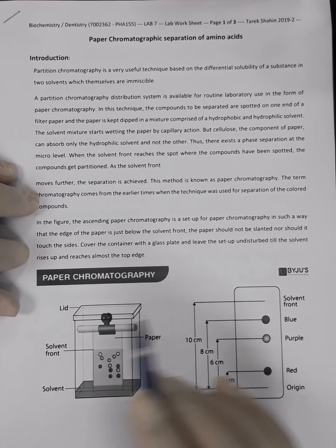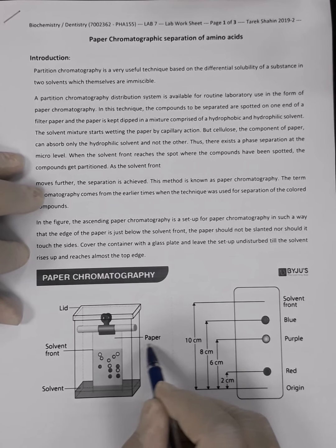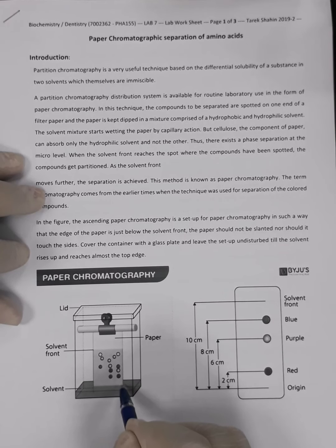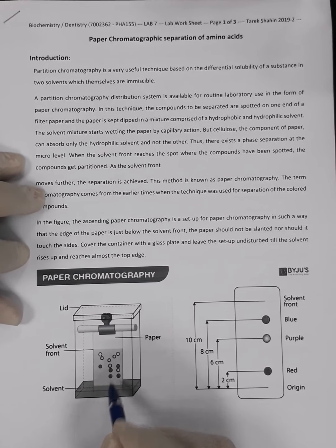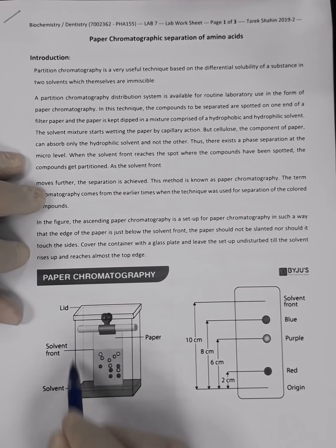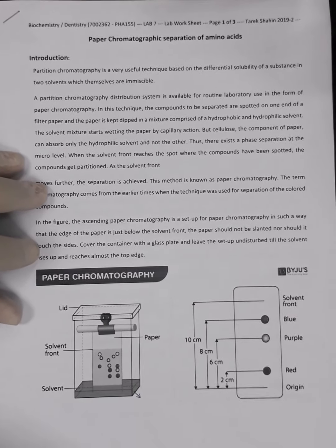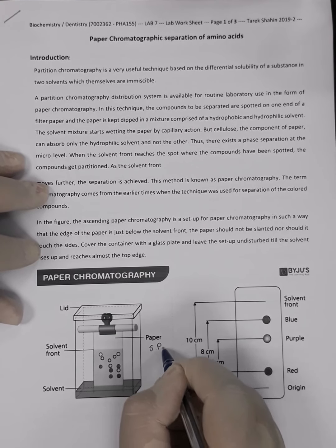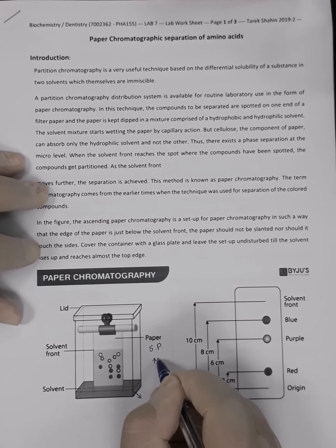The idea of the paper chromatographic separation is summarized by having a paper which is made of cellulose. We call it chromatographic paper, and on the bottom part of this paper we will put our sample and the standard chemicals. Then we are going to place this paper inside a jar. We call it a chromatographic jar, and in the bottom part of that jar we have a liquid. The paper is fixed in position. That's why we call it the stationary phase, and it is made up of cellulose, as we said, so it has high polarity.